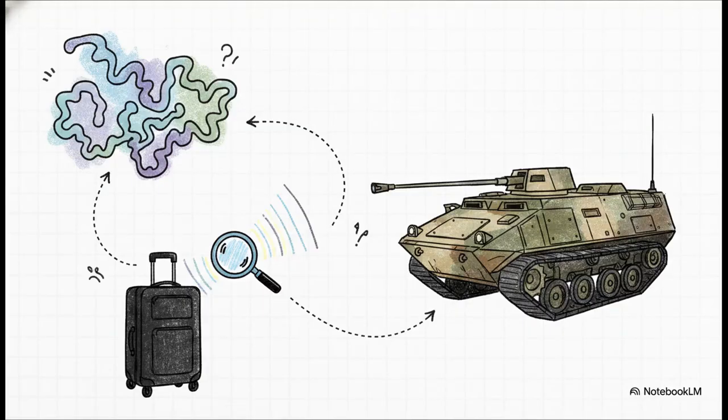Because of this incredible speed, the structural simplicity of just using an empty tube, and the complete lack of restricting magnetic fields, TOF basically has no upper weight limit. It's used in the real world to analyze massive biological molecules, complex proteins, huge polymers, critical antibodies, stuff that would simply be way too heavy for a standard quadrupole to even handle.